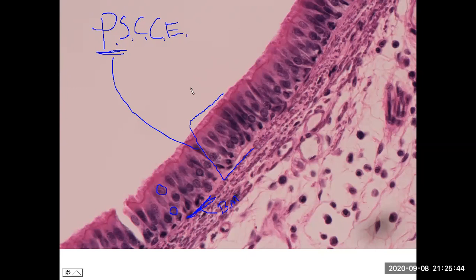So pseudostratified, the cilia appear as these extensions here. And we'll zoom in closer. But certainly much longer than microvilli, the cilia. And pseudostratification is only ever seen with the columnar shape. Some columnar cells will grow longer, other columnar cells are shorter, and with the distribution of their nuclei, that's what now gives the appearance of the pseudostratified appearance.